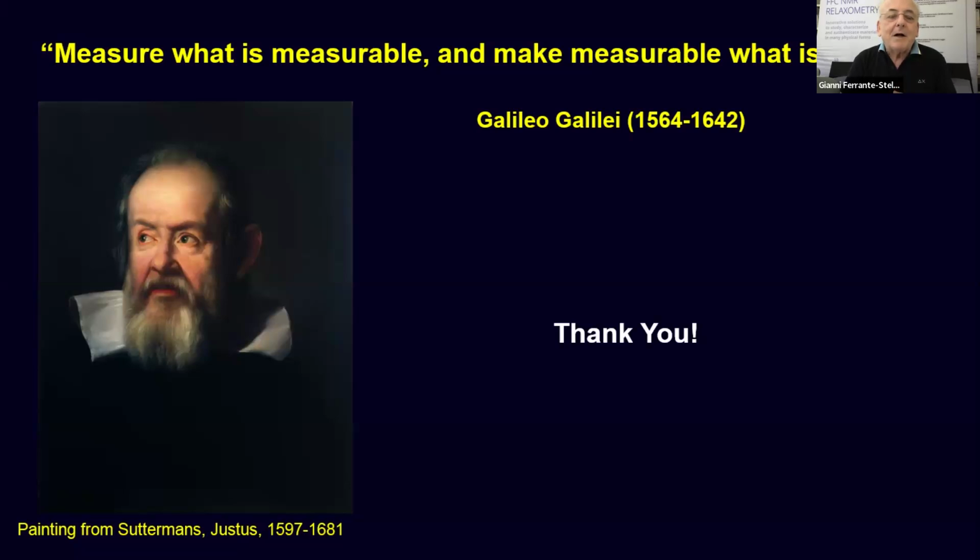But setting properly parameters depends on the knowledge, training and many other things of the user in the use of the machine, combined with some knowledge on the system they want to observe and what they are expecting.